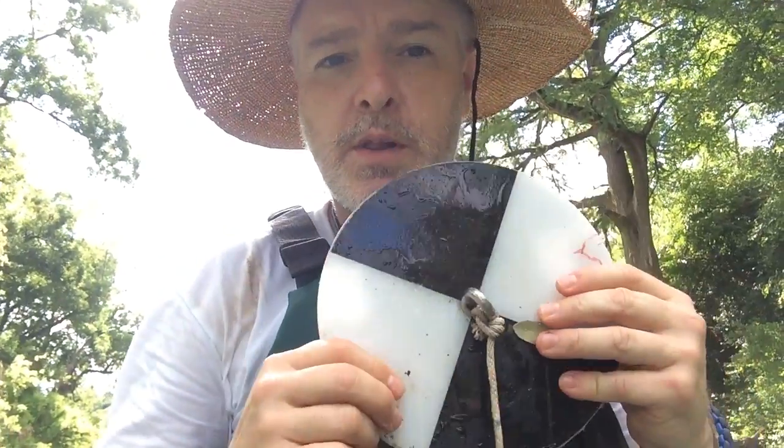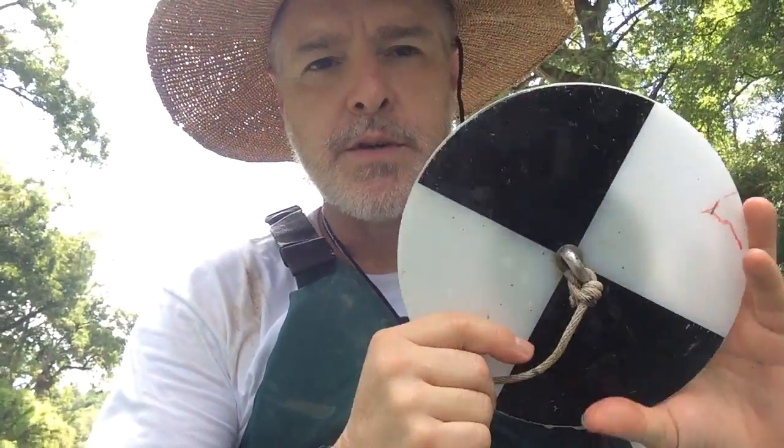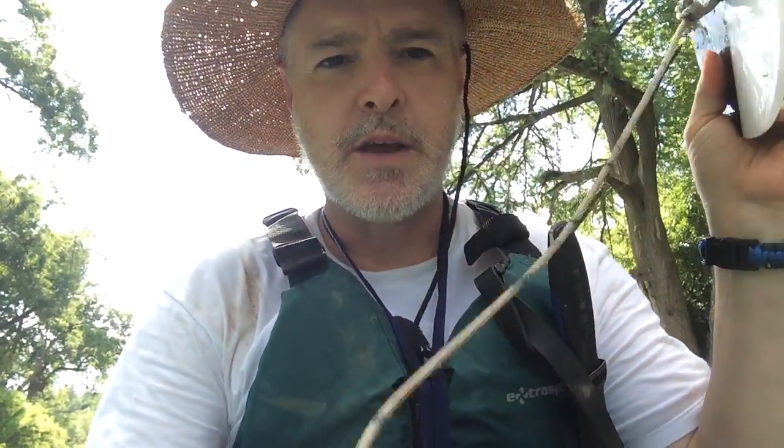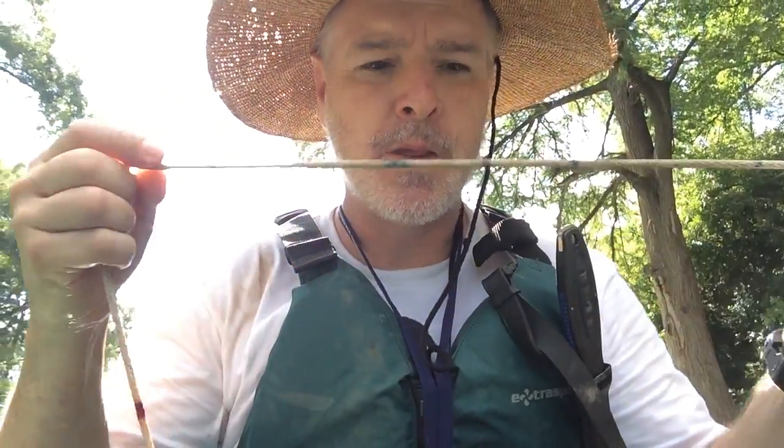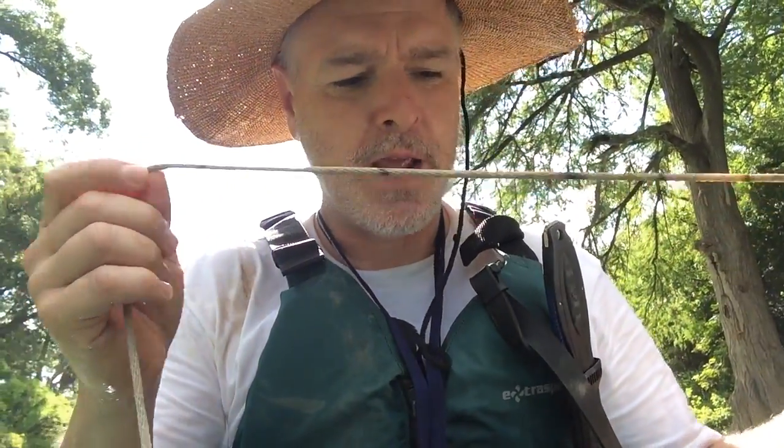Now we're going to do the Secchi disc. This is for water clarity. This is an 8-inch freshwater Secchi disc — the saltwater ones are 12 inches. What we do is we lower this down until we can't see it any further, and the line is indicated in feet, so you have foot and half-foot marks.